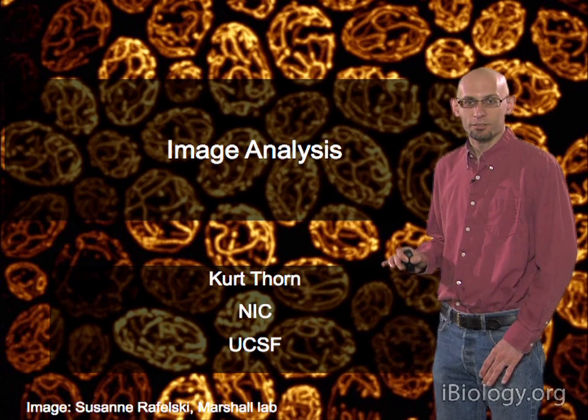There's a lot of refinements on this for doing more sophisticated ways to threshold, and image segmentation after thresholding, where you try and separate objects that are touching. But at the base of all these segmentation algorithms is this idea of thresholding, that you can separate your picture into a foreground intensity and a background intensity in some automated manner.